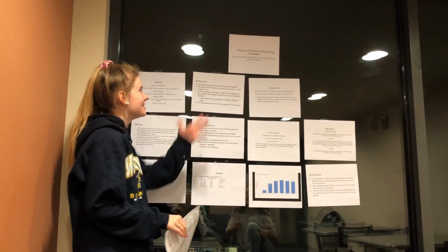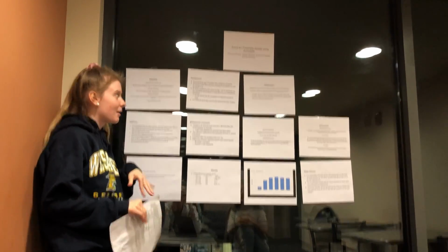My name is Sophie Baldwin, and this is the assay for proteolytic activity using azocasein. Just a little bit of background.